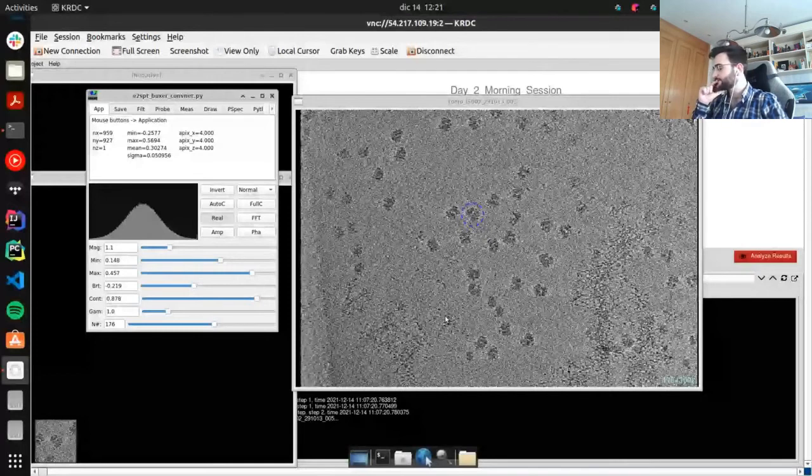If you're using noVNC, you can simulate the control. There's a slider on the left, but this is not very user friendly. Maybe you can show them. I don't know if you have noVNC access. I can try. Yeah, I'm just going to answer this question.